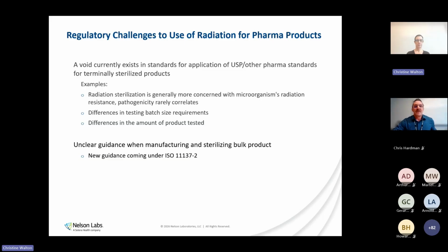So some regulatory challenges that we run into. There's a void that currently exists in standards. Christine touched on a lot of these during her portion of her presentation. There are different requirements whether you're following USP or ISO. There are differences in test batch sizes or sampling plans, and differences in the amounts of product that are tested. Generally with ISO, we're more concerned about what the sterile label claim is.